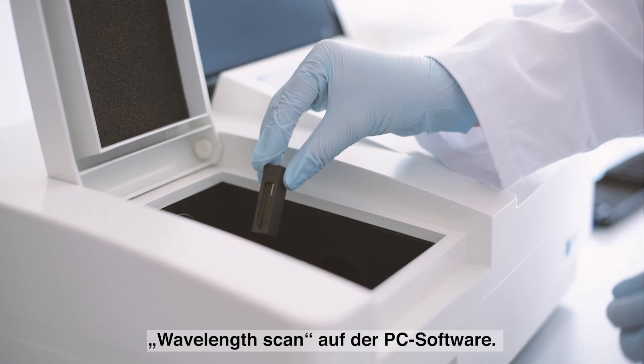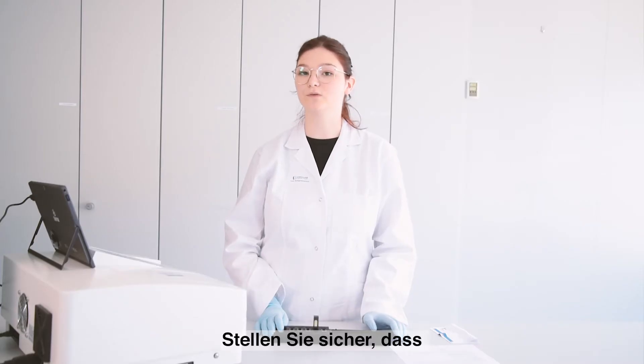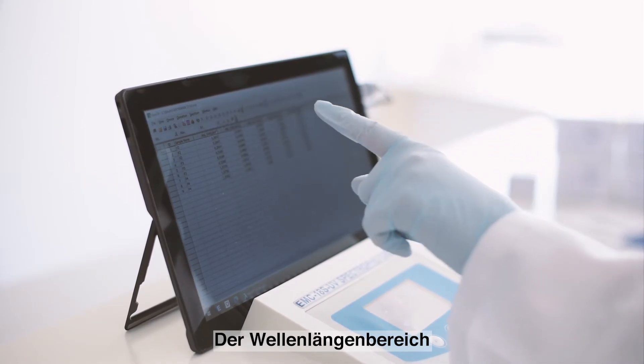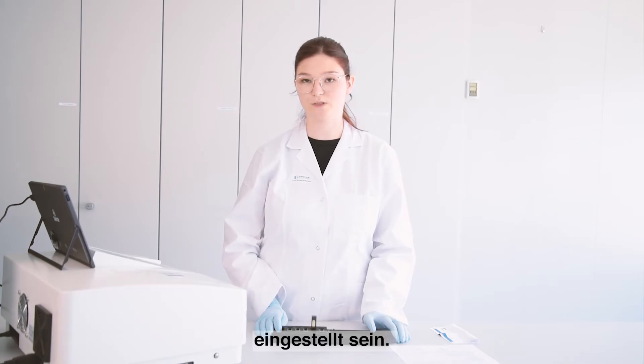Now you can select the mode wavelength scan on your PC software and be sure to include all the wavelength peaks which are listed on the calibration certificate, and select a wavelength range between 250 and 650 nm.